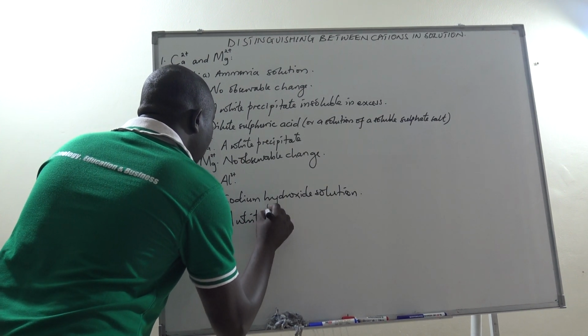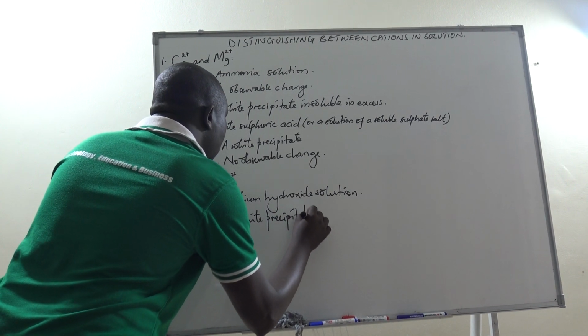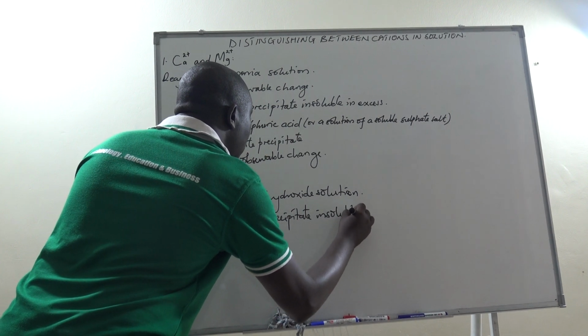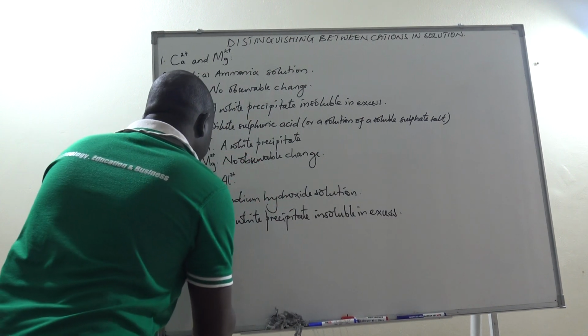a white precipitate insoluble in excess. Perfect.